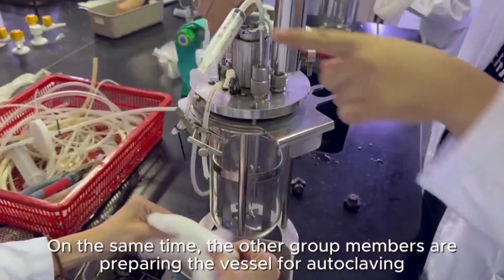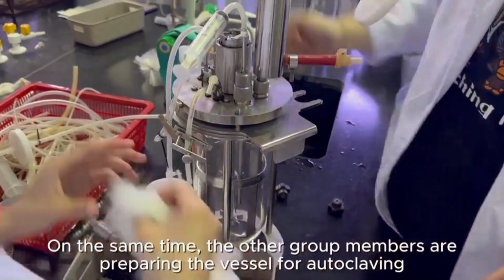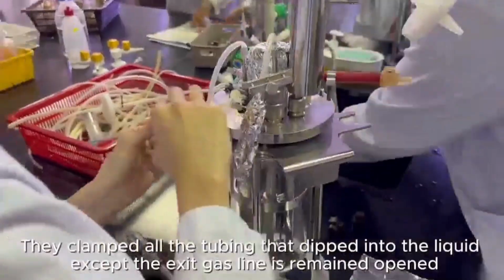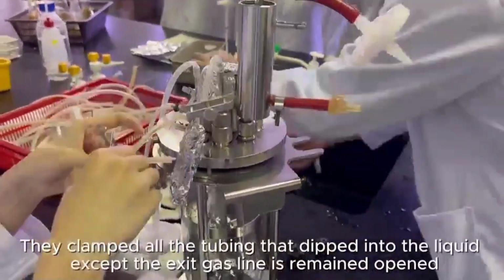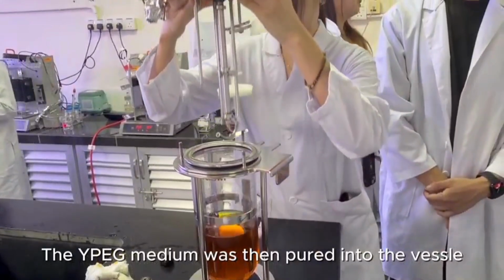Step 2. Autoclaving preparation. At the same time, the other group members prepared the vessel for autoclaving. They clamped all the tubing that dipped into the liquid except the exit gas line, which remained open. The YPEG medium was then poured into the vessel.